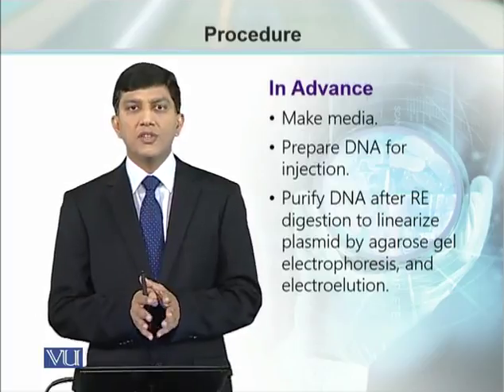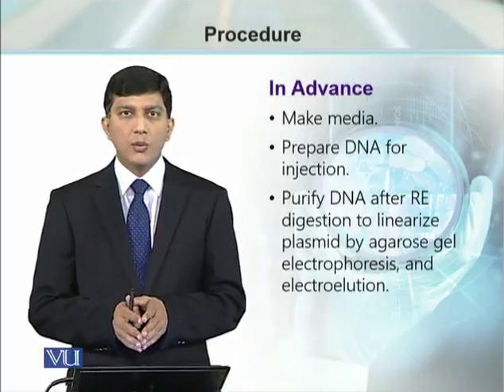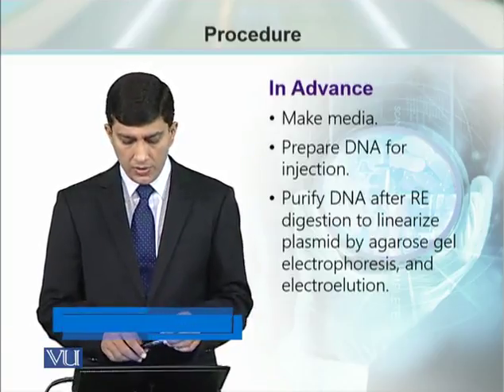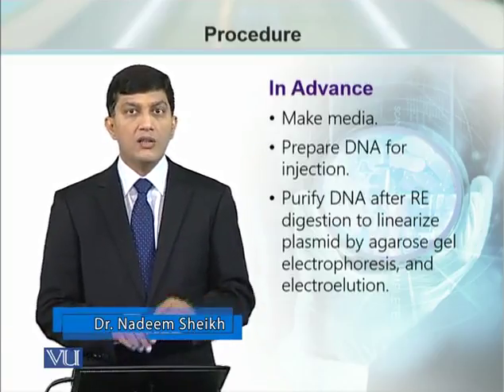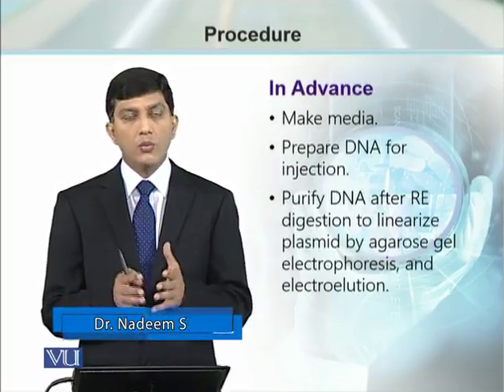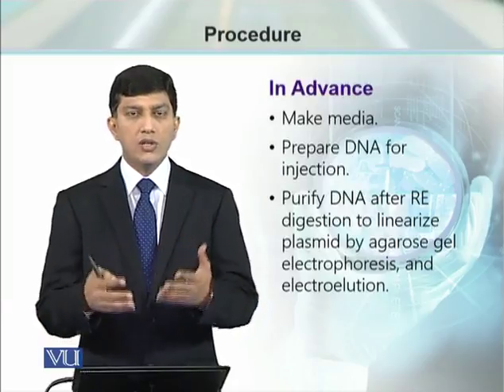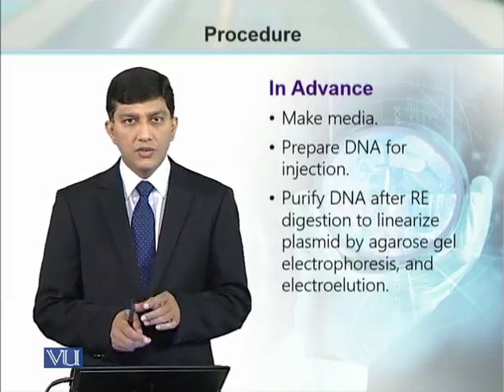All the reagents and media, the reagents and supplies we talked about, we have to prepare in advance. We need to prepare the DNA for injection in advance, that was cloned or any sample which you want to inject and create the transgenic mice.